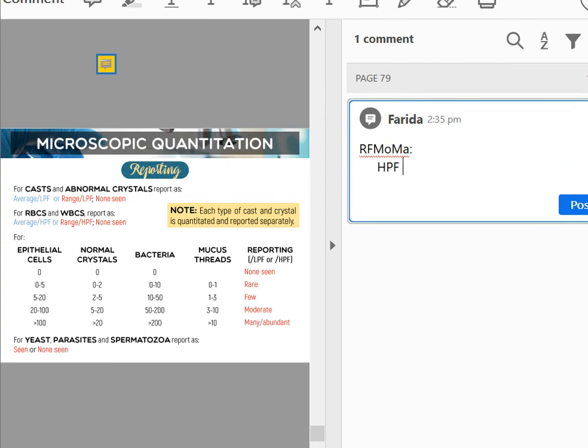For HPF, we use the mnemonic "titibayan." It's a bit naughty, guys, but if it's naughty, it's easier for the students to remember. So, C, if HPF, you have your titibayan. Or you can tell it to yourself: yes, I will be firm about this, guys. Basta, titibayan mo na siya.